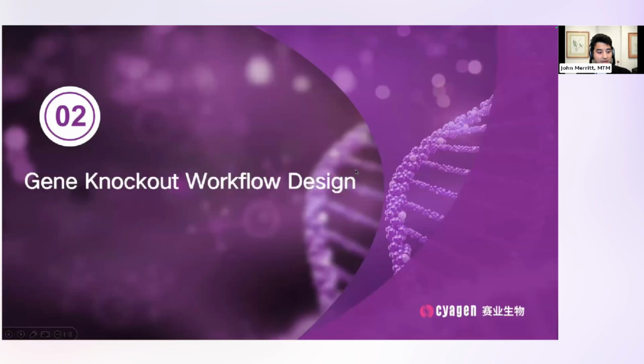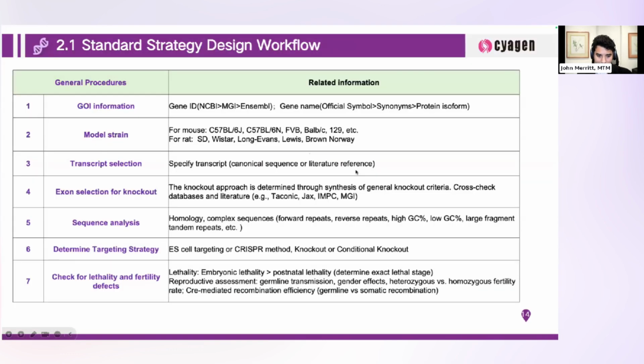I also wanted to talk about how we make a knockout mouse model. When people send us an inquiry for a knockout mouse model, they ask what type, how did you make it, essentially. We first search through the literature and see what people want made.